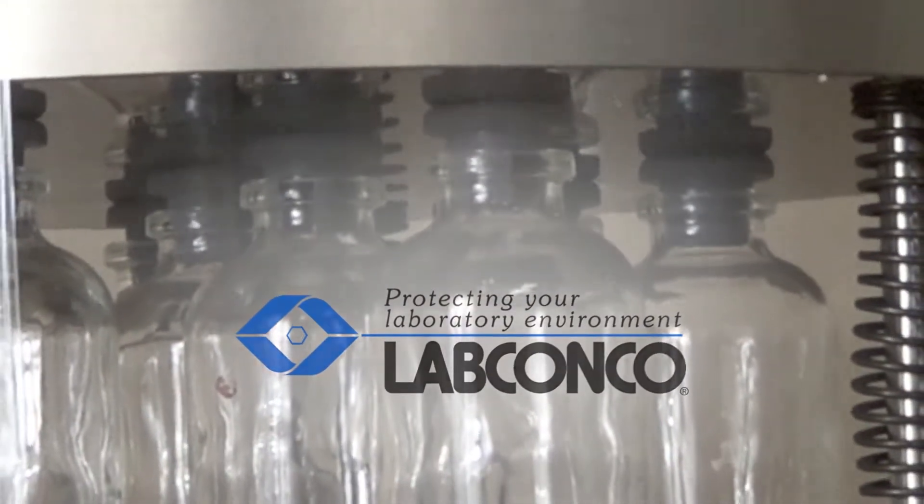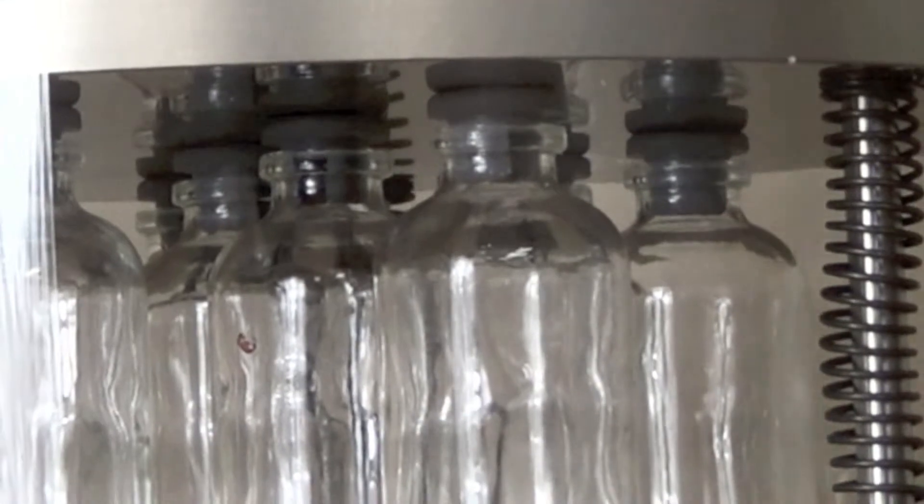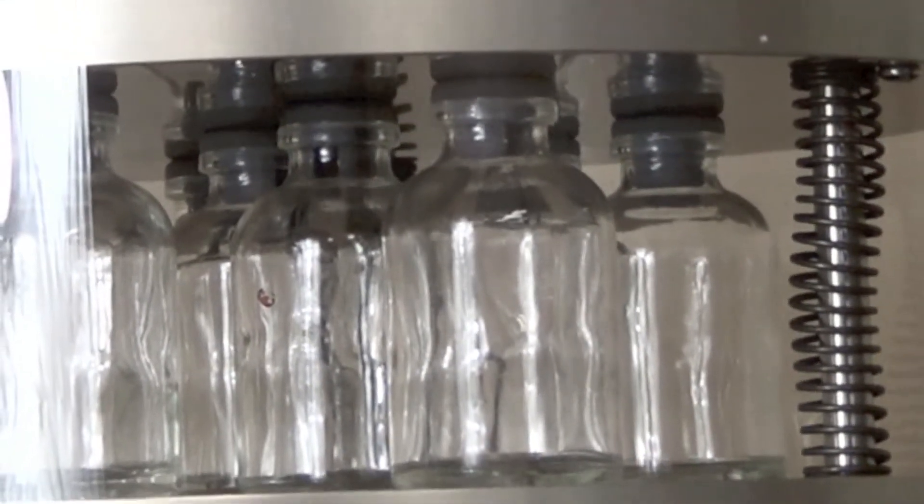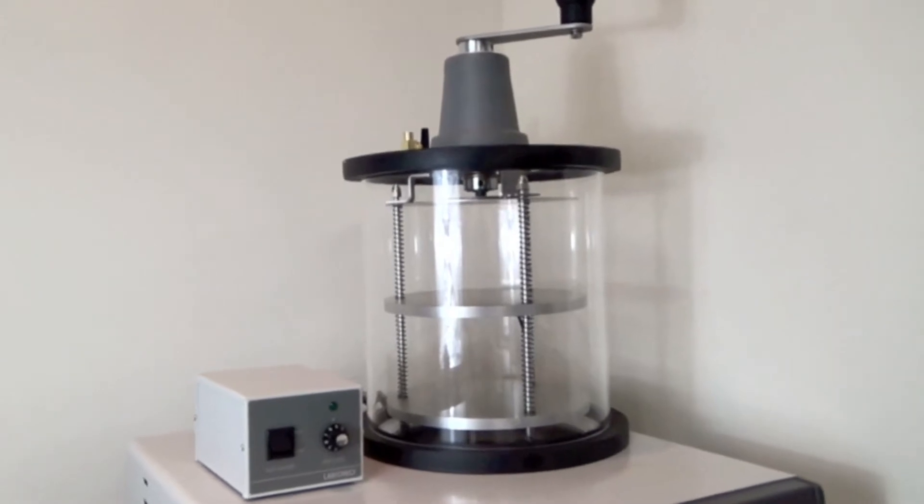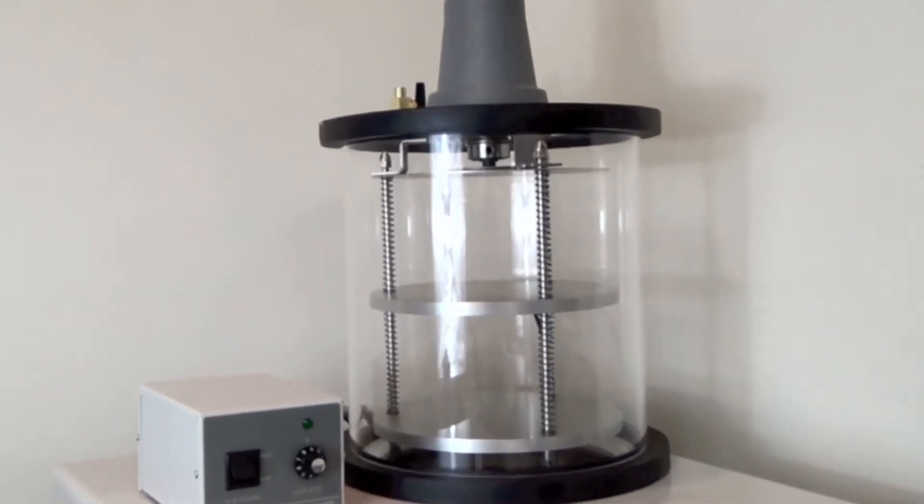After the lyophilization process, samples can be stoppered under vacuum for long-term storage. The clear stoppering chamber can stopper vials up to 5 milliliters under vacuum on its two shelves.